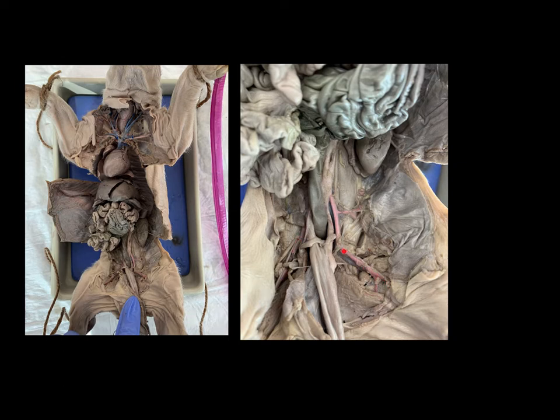And these are the left and right femoral arteries. Remember the femur, that's the bone in the upper leg. So these run along that same area.